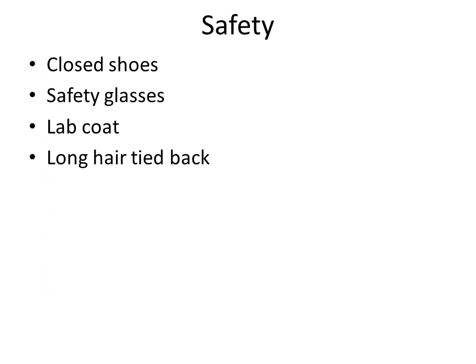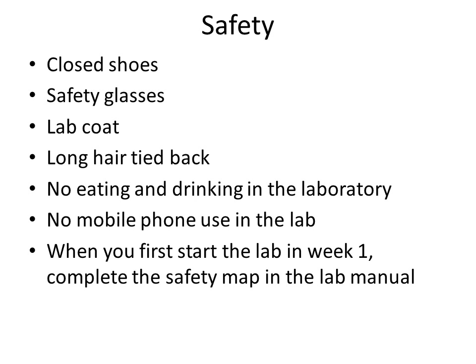As usual, there should be no eating or drinking in the laboratory, and you are not permitted to use your mobile phones while you're in the lab. If you absolutely must take a call, please step outside. The only exception to this rule is that you may use your camera to photograph some results for your report, such as your TLC plates.